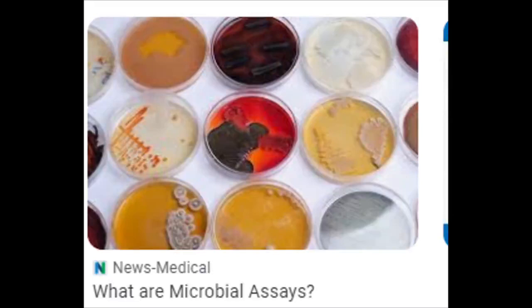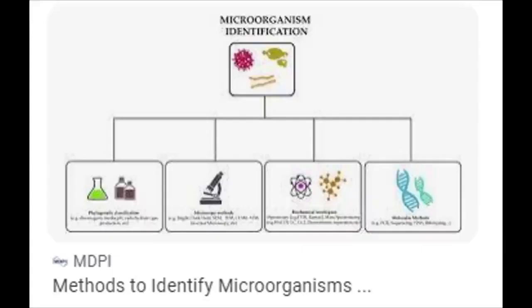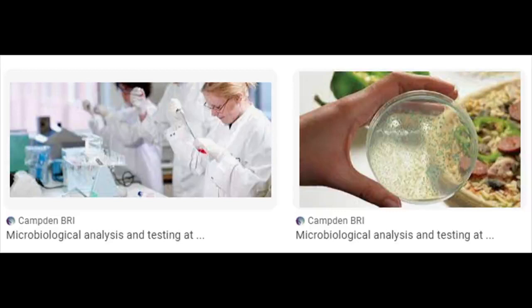Then you can also use the most recent one, which is the DNA RNA methodology. So we can also use the DNA RNA methodology. So let's move further ahead now and look at methods for the microbiological examination of foods.